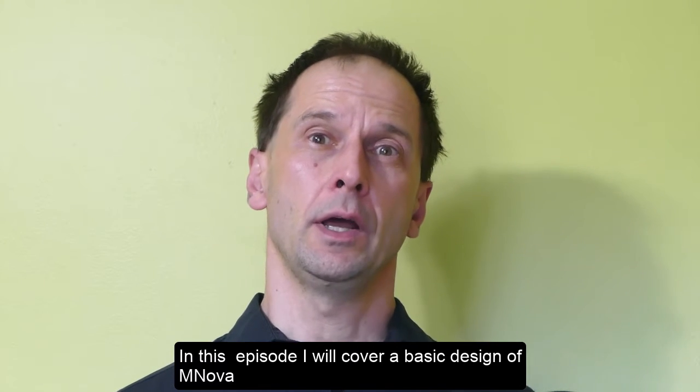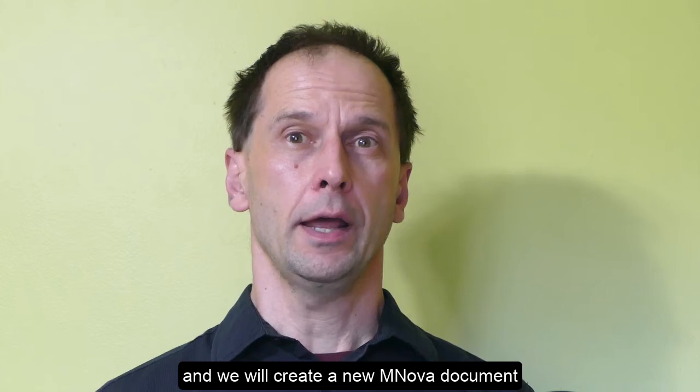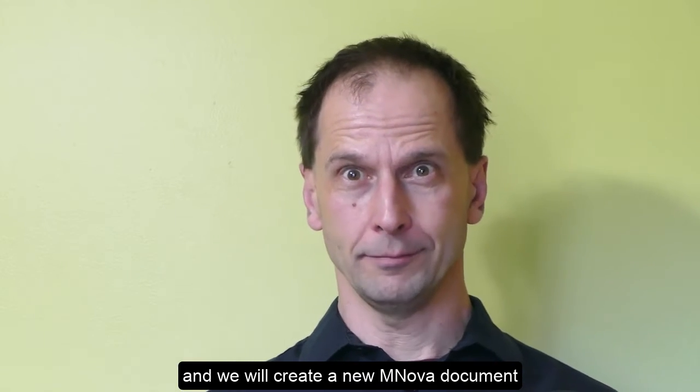In this episode, I will cover basic design of MNova and we will create a new MNova document.